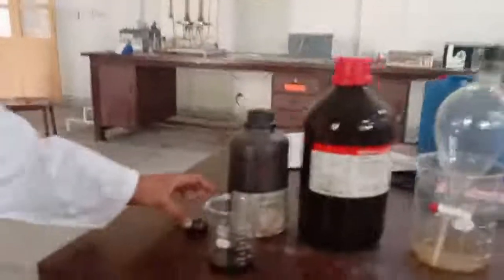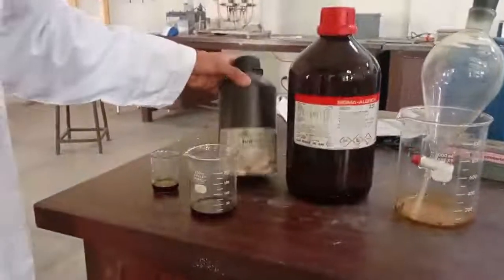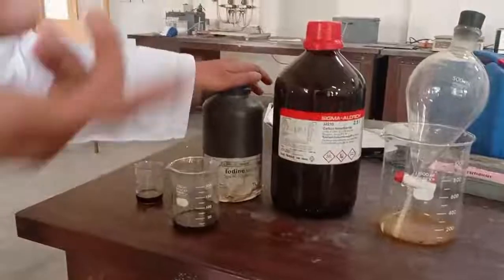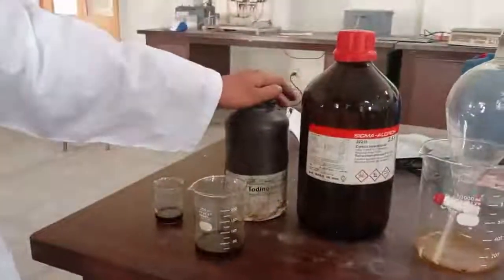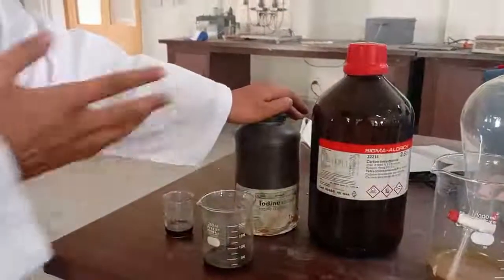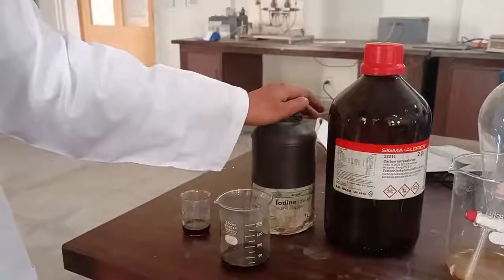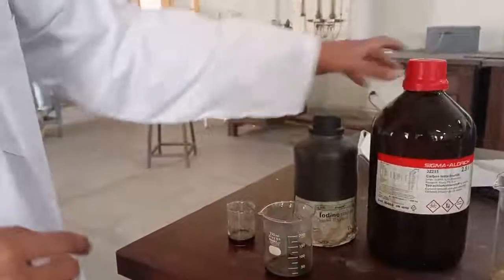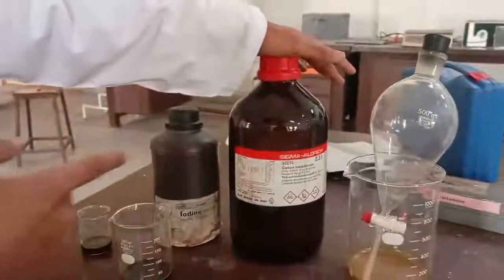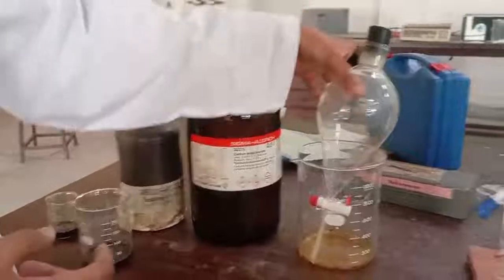For this experiment we have iodine already in 5% solution. We can also make 4% or 3% solutions of iodine using different formulas. But in this experiment we use only 5% iodine solution. Here is carbon tetrachloride (CCl4) and this is the separating funnel.